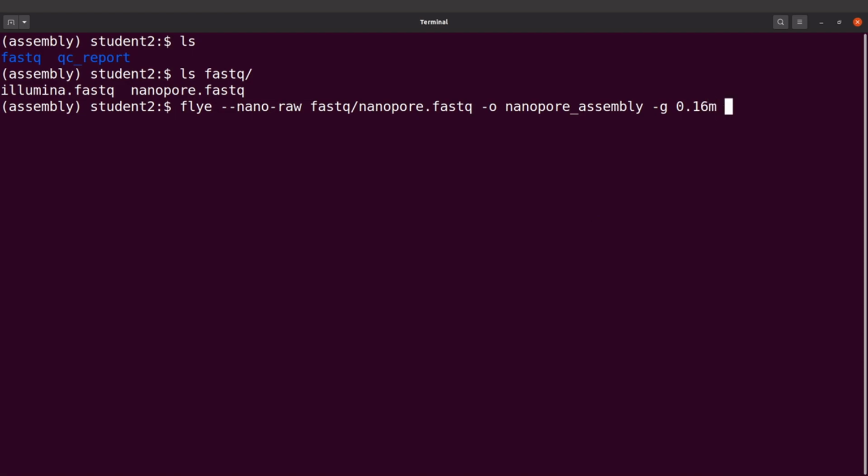And then we can also indicate the number of threads. I'll say that's C. So the number of threads, I'm going to use 8. I can also use a higher number. If you have a high-end PC or if you're working on a computer cluster, chances are you have lots of cores. So you can increase this number to 10 to 20 or 30 or whatever you want. Okay, so if you have more threads, then the assembly process will be faster. Okay, but if you're using a normal laptop, then you can use 8. Okay, if you use 8 and it's too slow, then you have to probably use a high-end PC or a computer cluster. So that's what it is.